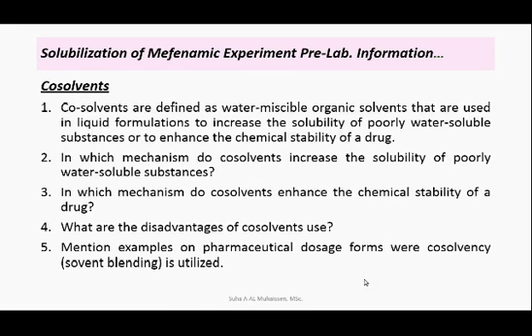Also, one of the objectives is to study the effect of co-solvents on the solubility of weak acids, or as a method to enhance the solubility.